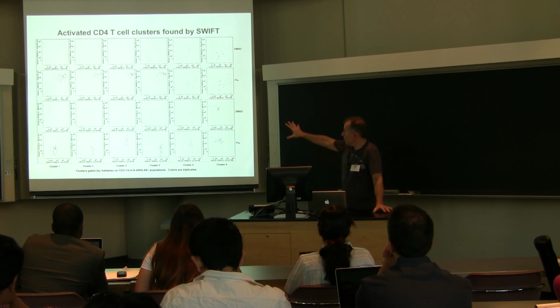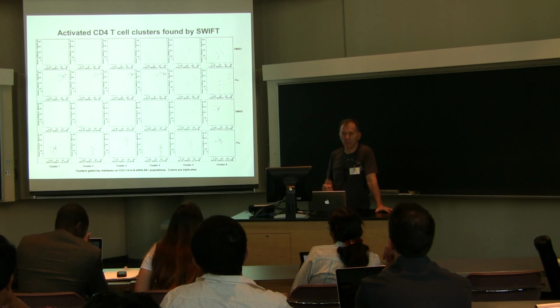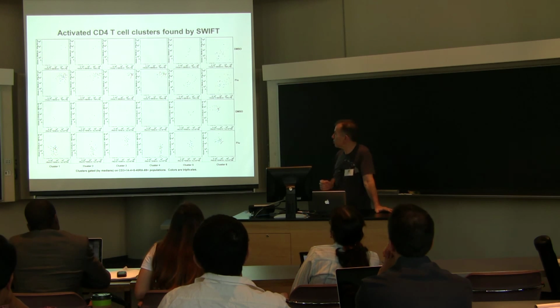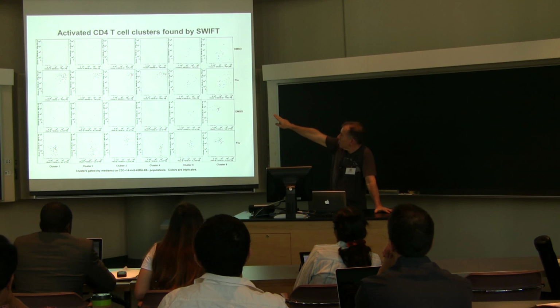And this looks a little sparse, there's not a lot of cells up there, but the sample, the concatenated sample is about 8 million cells. So this is gated down from a very large population. And what you can see is now that there are 6 clusters here from left to right. And the top row, we've separated out the 3 controls. And if you look at the first 4 populations, the first 4 clusters, there's almost no cells there.